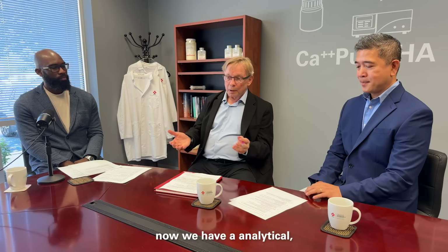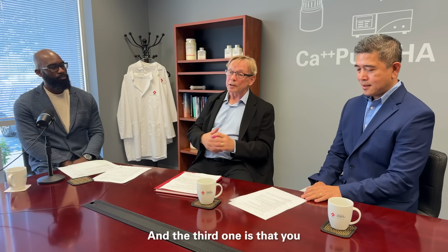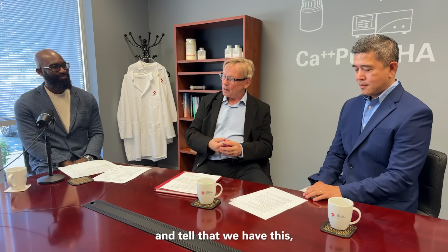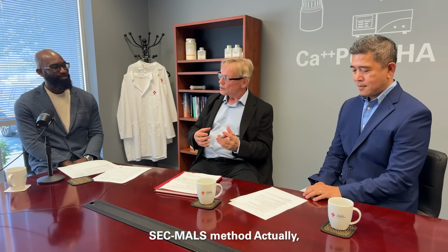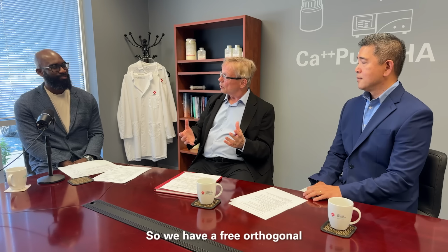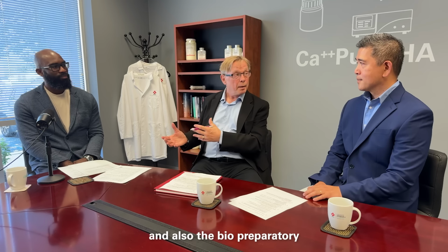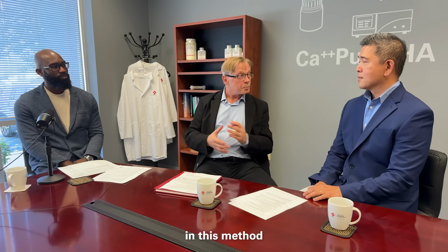Now we have an analytical method, we have a purification method, and the third one, I would like to address you, Anson, is this light scattering method that we have also developed. We have three orthogonal analytical methods to assess the purity of the sample, and also the preparative method, using totally non-toxic salt in this method.